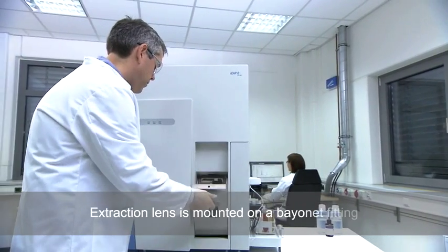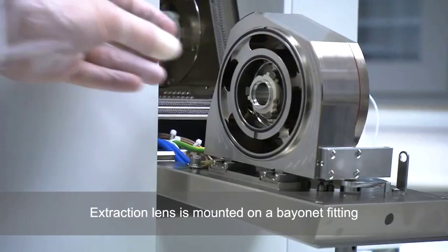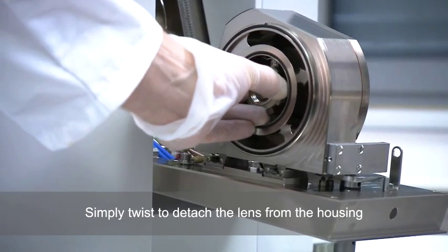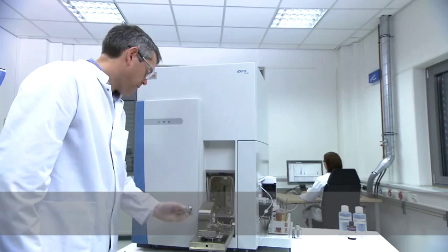For simplicity, the extraction lens is mounted on a bayonet fitting. A simple twist is all that's needed to detach the lens from the housing for examination, cleaning, or replacement.